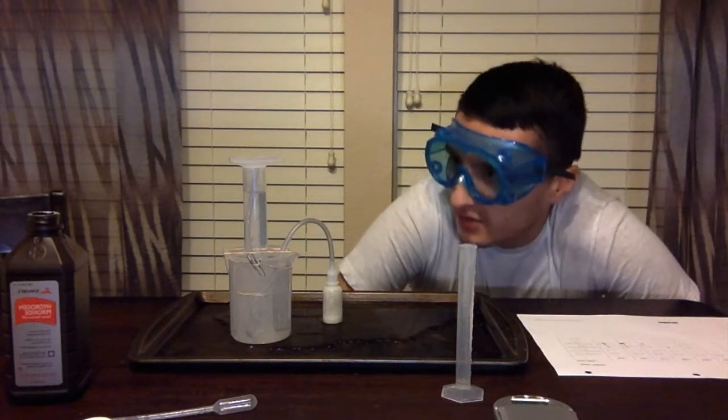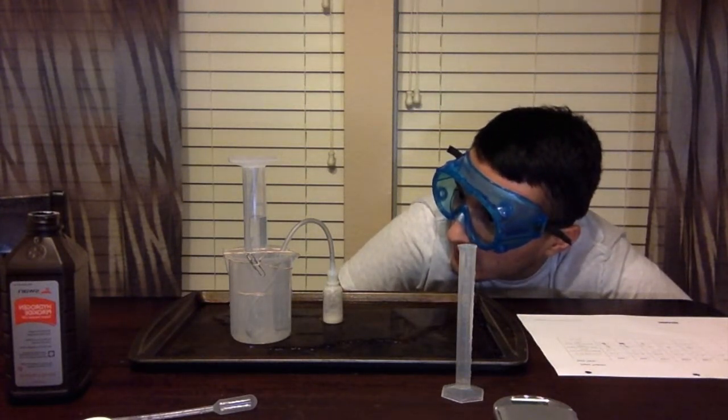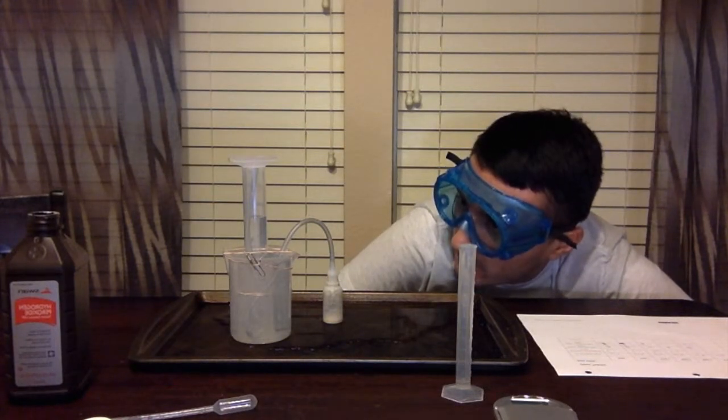Looks like we just passed 10 milliliters. 15. 20. 24. Looks like we're slightly over 24. 25.